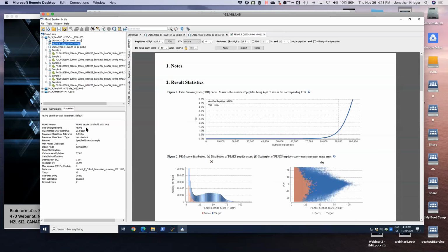Basically what we did is ran a standard database search against a UniProt database with the 3 species, and what you get as your output is your summary page. New to PEAKS Pro, you have some more controls when it comes to the data view. And I will mention, just as a reminder, that anything that you set in the filters on the summary page corresponds to all the subsequent pages. Whatever parameters we set here will correspond to both the exports as well as the protein and the peptide tabs and so on.